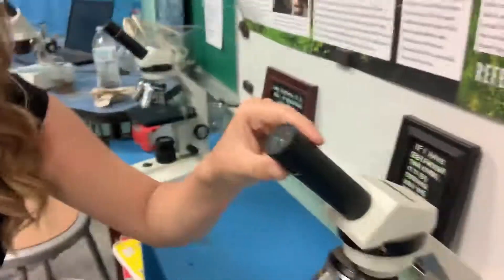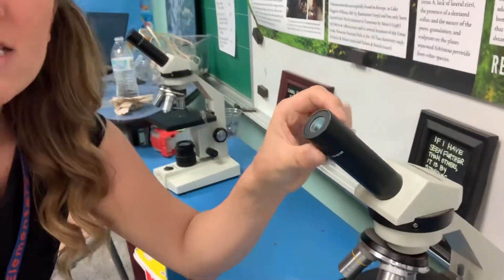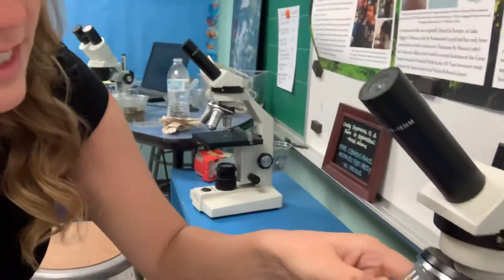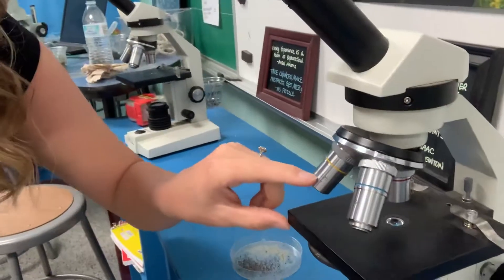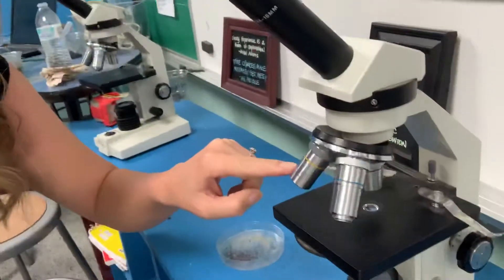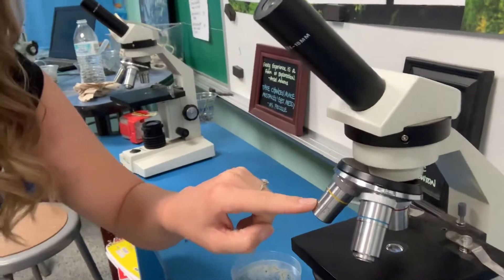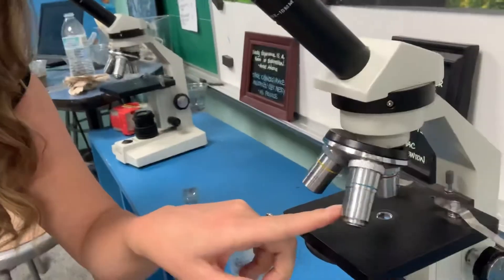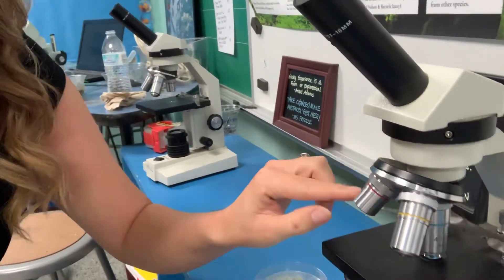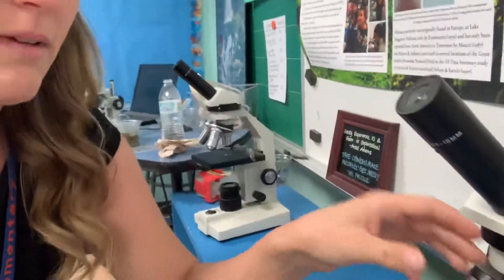The way that you figure out how magnified you are is by multiplying what the ocular lens says. So this is 10x, that's times 10. And then the second lens down here says times 10, so this would be 10 times 10, which would be 100. Or this is 10 times 40, which would be 400. Or you have 10 times 4, which would just be 40. So there are different magnifications.